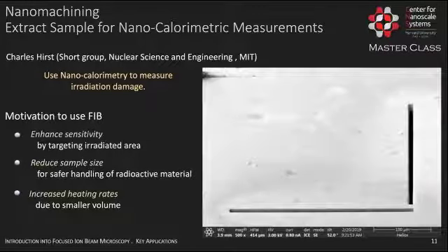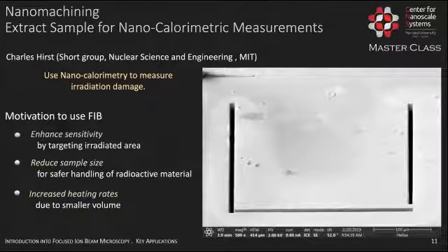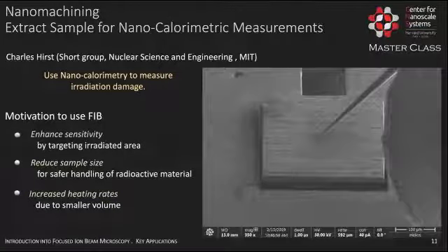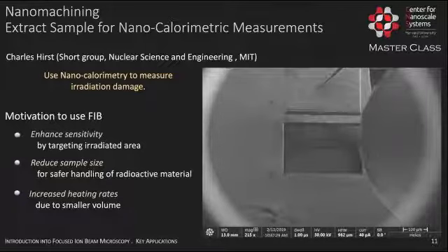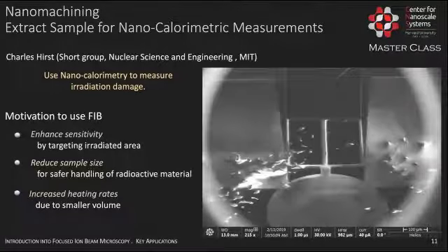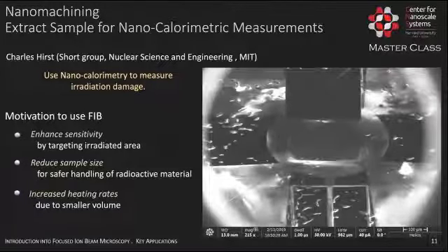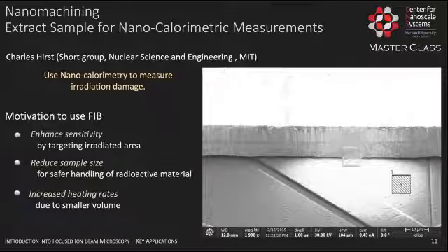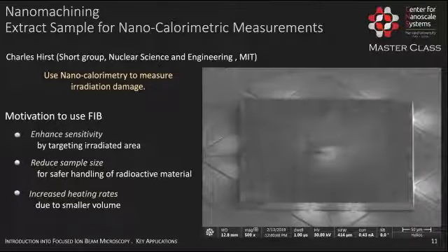So he provided me very nicely with a wonderful little time lapse that shows the process, which can be seen as a prototype for many other applications. So TEM sample preparation and atom probe preparation are basically using the same routine where you extract your sample, you pull it out with the OmniProbe needle.